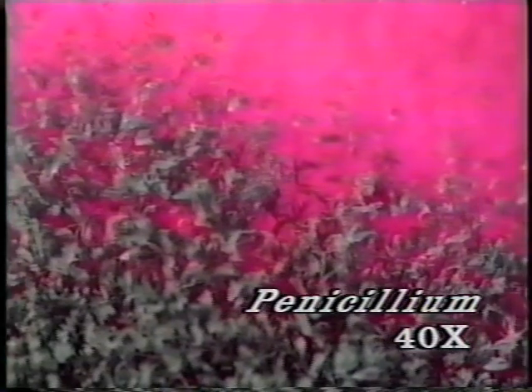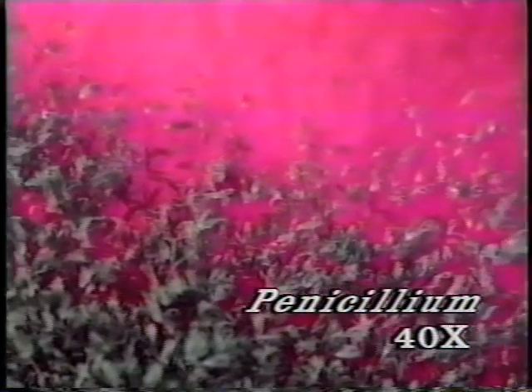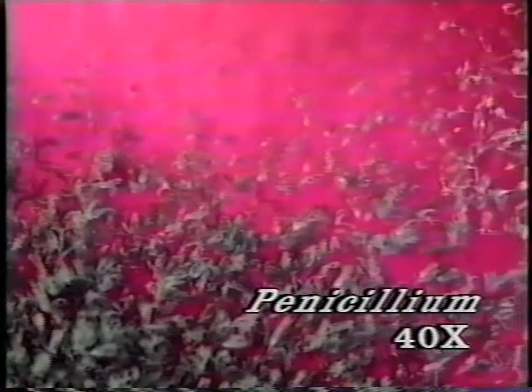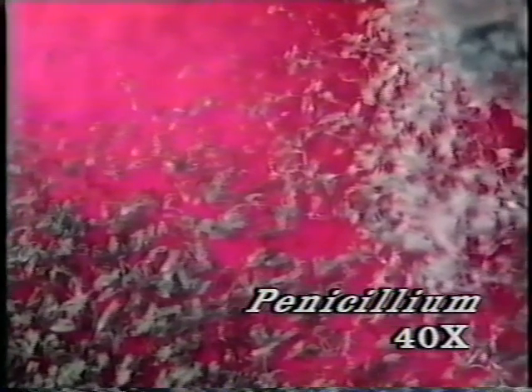This is a view of Penicillium at 40x magnification. A member of this genus produces the antibiotic penicillin. Lawns and forests of conidia are waving in the air as you scan this view. The fungus is in the foreground, with a red medium in the background. A view at 100x magnification.